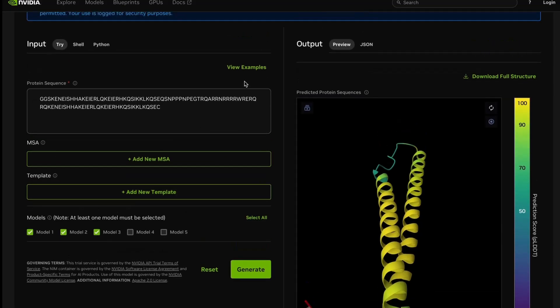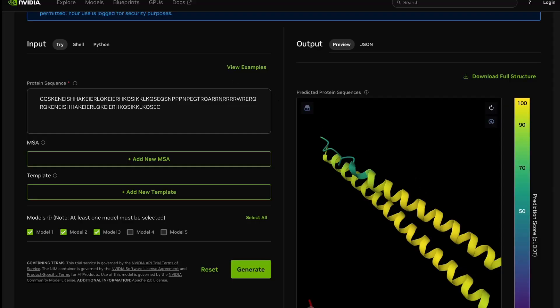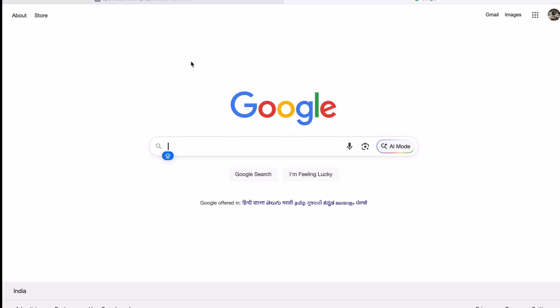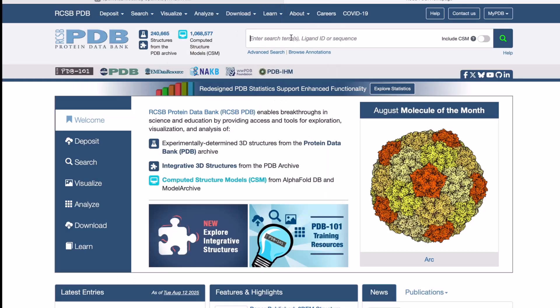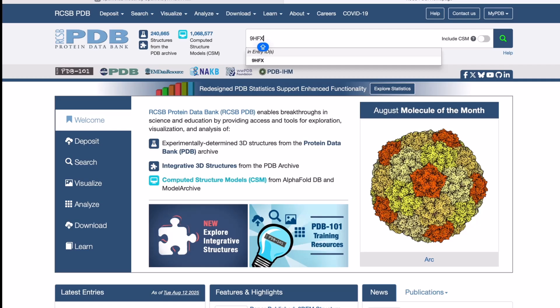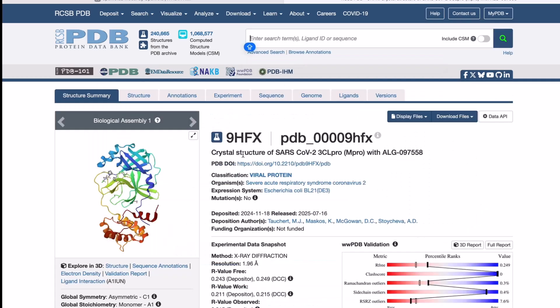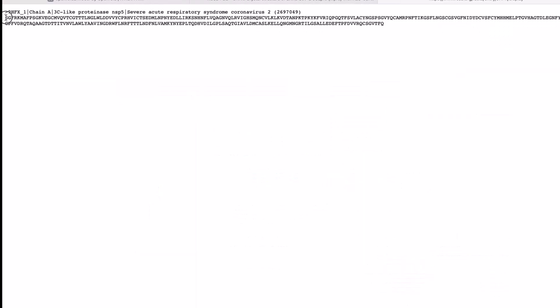Let's take an example for today's understanding. I'll open a site and choose a random protein to show how to do the modeling. Using AlphaFold and other such servers you can only model normal or wild-type proteins, but here you can also model mutant proteins. Let's search for 3CLpro, which is the main protease of SARS-CoV-2. I can search by the protein name or by a PDB accession ID. This is the crystalline structure of SARS-CoV-2 3CLpro main protease. I'll go to Display and FASTA sequence, copy the FASTA sequence, and paste it into the server.